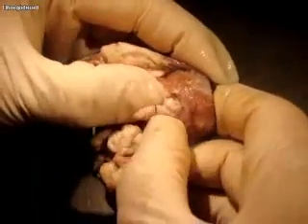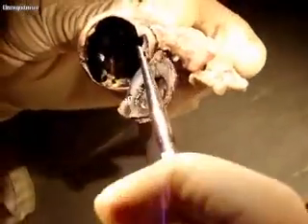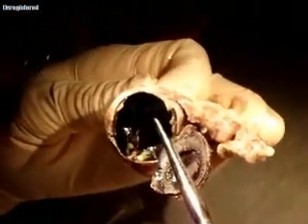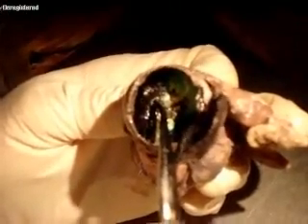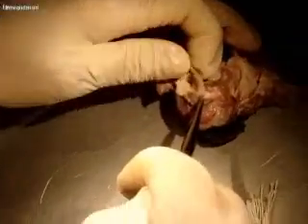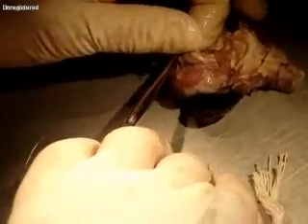And the blind spot is also known as the optic disc. And it's going to be exactly in the same spot. You can see it when I pull on it here. It's exactly in the same spot as where the retina is attached. Because it's actually that... Am I off camera? Oh, sorry. It's exactly at the spot where the retina is attached. This is the inside. Here's the outside. So the optic nerve, the blood vessels, and everything emanate from that part of the eye.